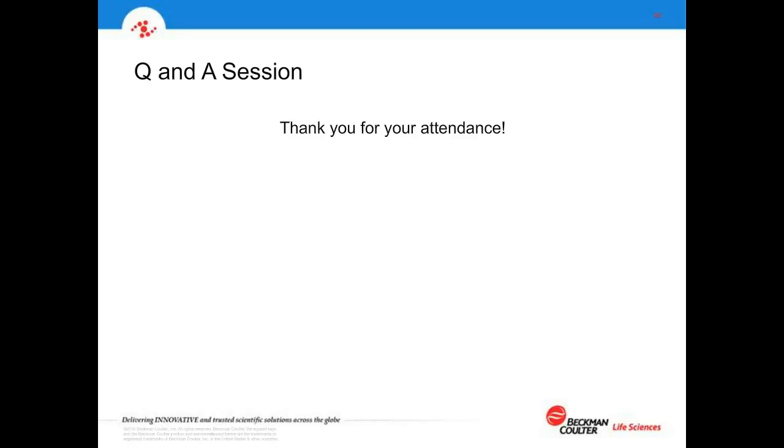Last comment would just be that although these changes are notable, you might say, they shouldn't be highly significant. There might be a few more points needed to satisfy 14644 or a grade A, B, C, D designation. But the purpose, again, is to build confidence that that zone or area meets the requirement needed for that particular aspect, and the risk is controlled well enough. So there's a purpose behind it, and hopefully we've captured that well enough in the documents.